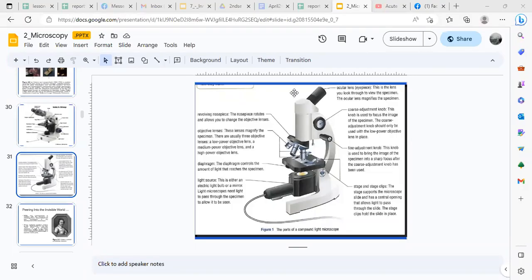So as I've mentioned, our exam in the lab will be practical. So it will be with the demonstration or the use of equipment and familiarity of procedure. Okay? So una sa lahat, syempre, yung parts of the microscope. So you must know which ones are the low objective lens and which ones are the high objective lens.